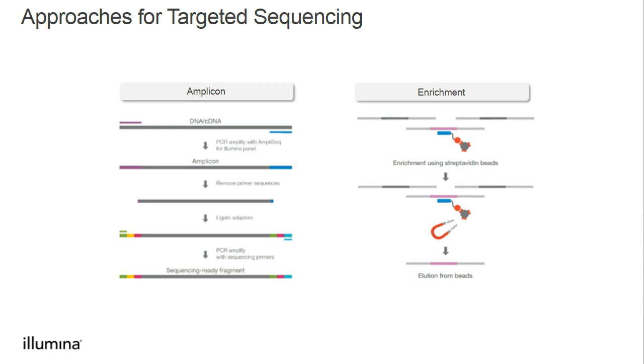And so we'll look at library prep kits for each of these methods, but I'll break them down by first looking at our DNA kits, and then we'll move to RNA. And then we also have some options that are designed for both DNA and RNA.